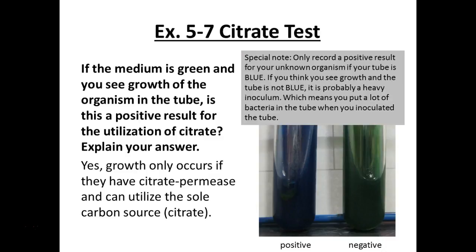Special note, only record in this class a positive result for your unknown if the tube is blue. If you think you see growth and it's not blue, it's probably a heavy inoculum. Like I said, you put too much bacteria in there to begin with. It didn't actually grow. That's not growth that you're seeing. Okay? Those of you guys that have blue tubes should have good growth, all right? See nice good growth. Lawn growth. Does that make sense to you guys?